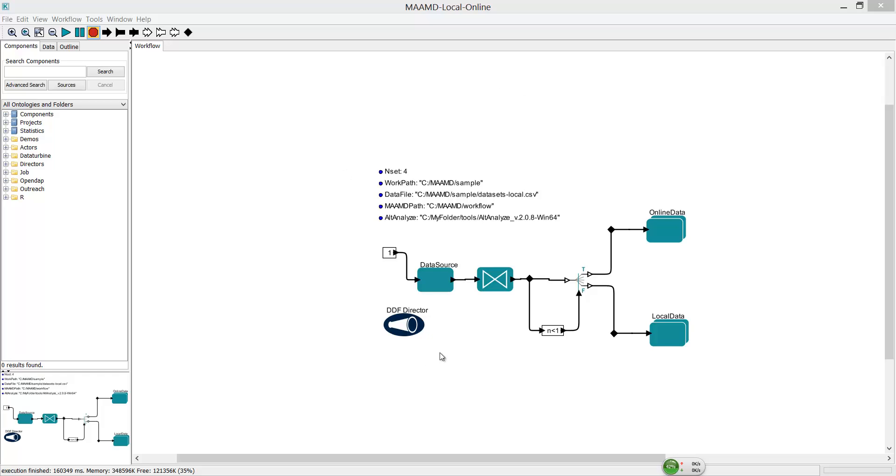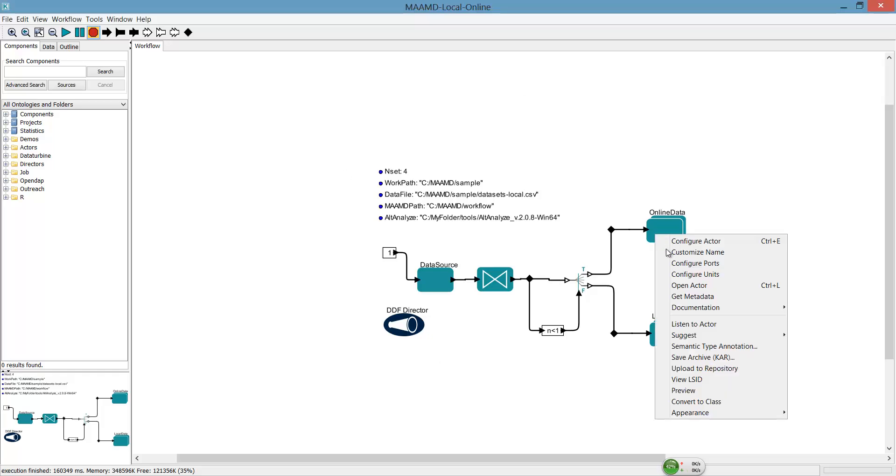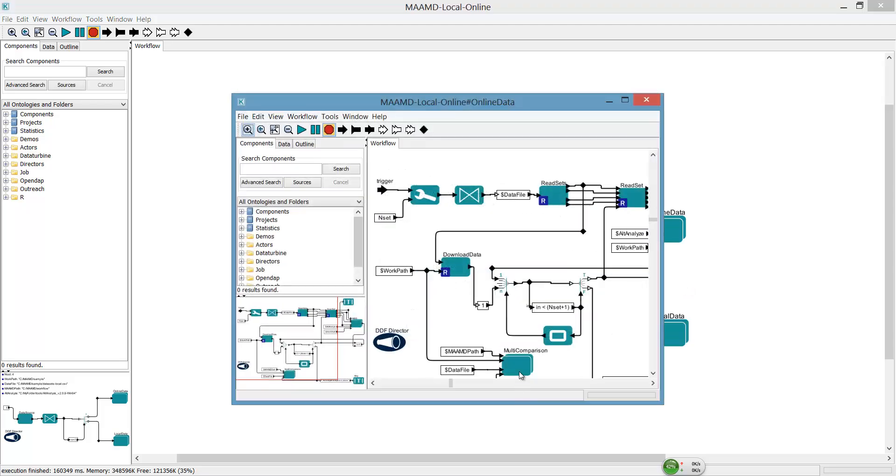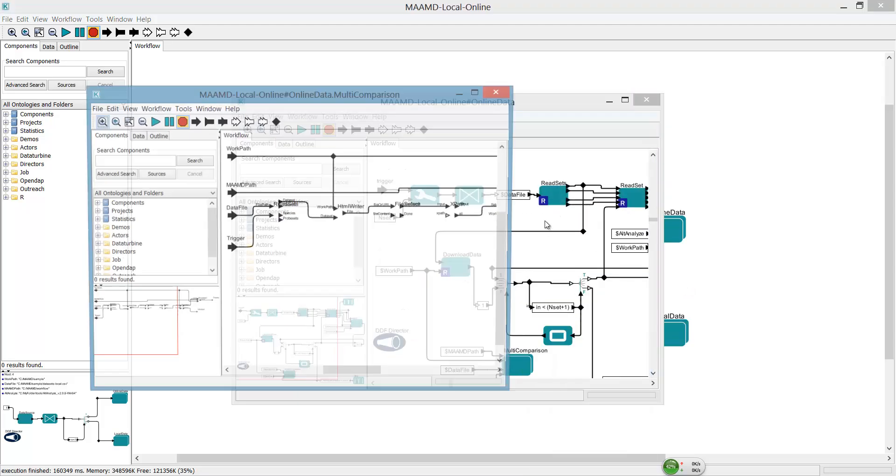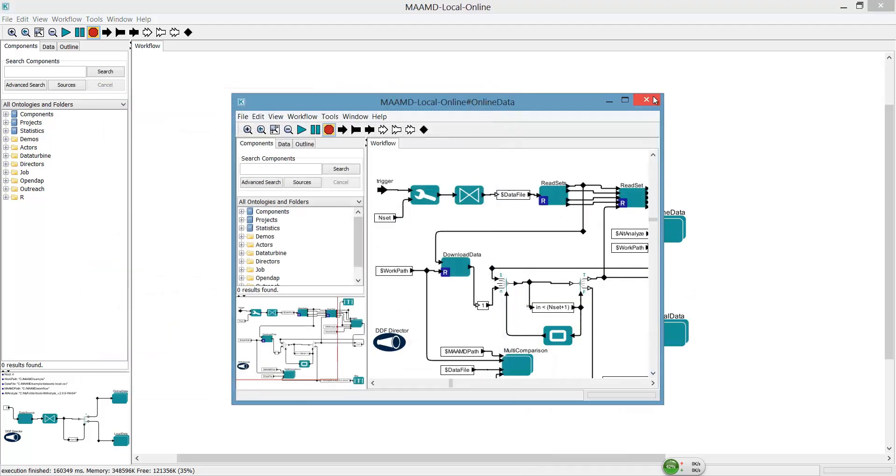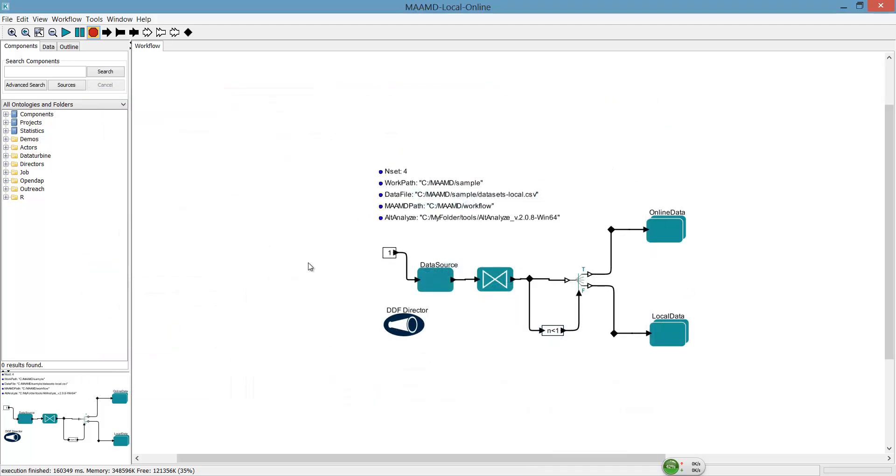This is the MAMD workflow. You can open Actors to see the detailed structure. And you are allowed to modify parameters to fit your computer setting.